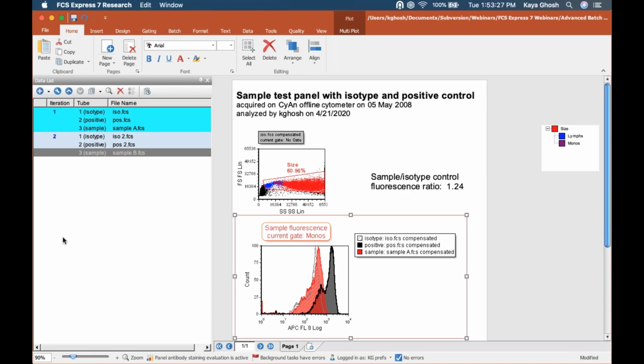And the panel would really help you analyze those more efficiently. And then you can use other features in FCS Express to enhance your analysis, like the scatter with regression plots, where you could put in a quantitative Michaelis-Menten curve and really evaluate how much antibody to use from each different clone based on the Vmax of that curve. You can automate your analysis and it can be quantitative and efficient. And that's just one example.